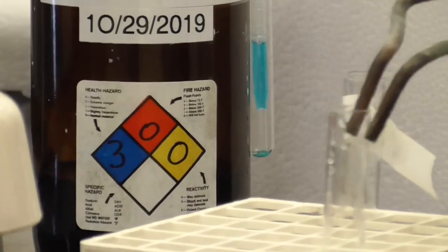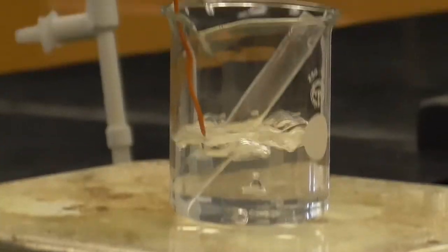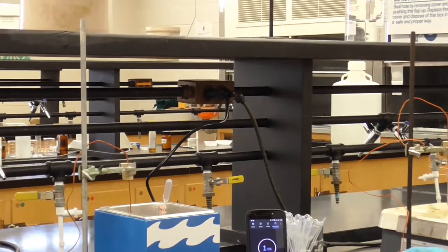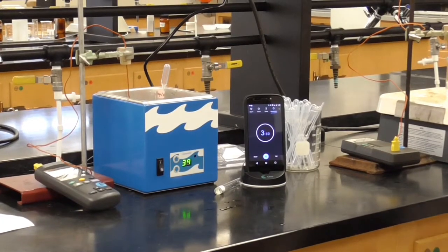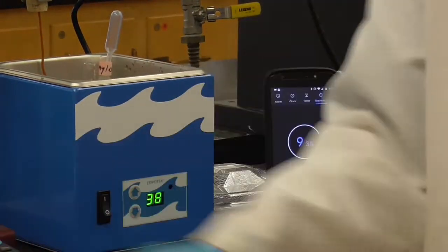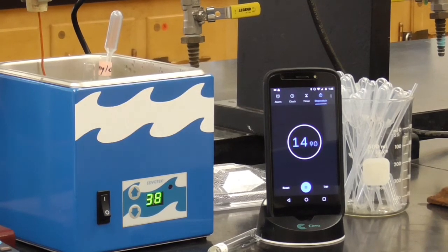Okay, and turn that to its hot temperature. And then the same thing for what's in the cold. The enzyme, the starch, combine that together and return it to its temperature. All right, so we're going to reset the timer now, I'll just set it to 0 and start it up again. So we're going to allow them to react for 10 minutes. You remember on the initial part and this plate, at 10 minutes we definitely saw activity, and so we're going to let these guys go for 10 minutes at their respective temperatures, and then we'll test them.